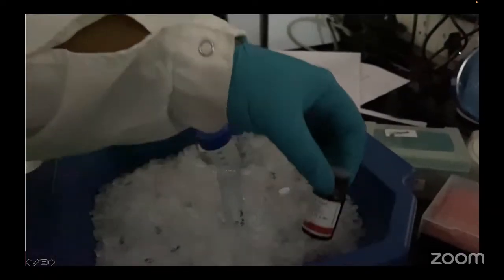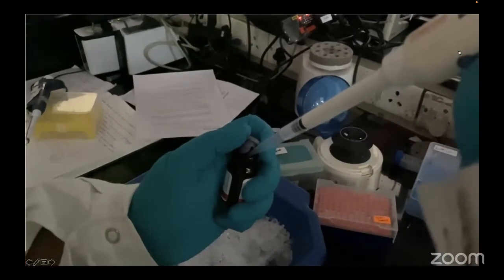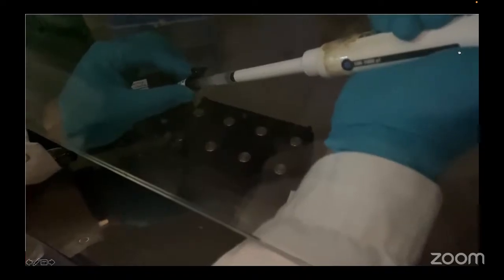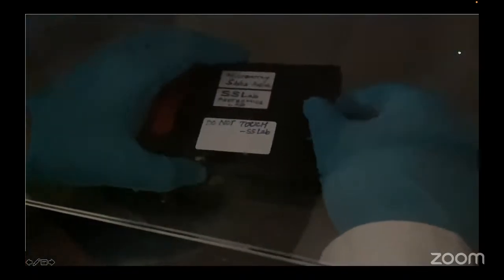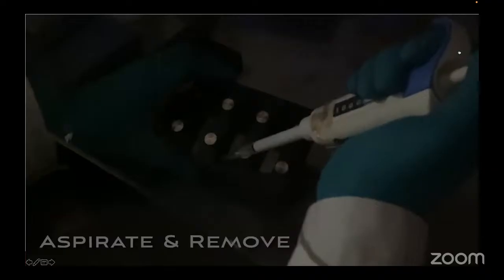Again, completely aspirate the washing buffer and add secondary antibody. Prepare a dilution of secondary antibody, 1:2000, and then slowly overlay the secondary antibody on the microarray chip. For 45 minutes, allow the incubation to happen at 140 RPM at room temperature. Make sure that you do not expose the slides to light at any given moment.